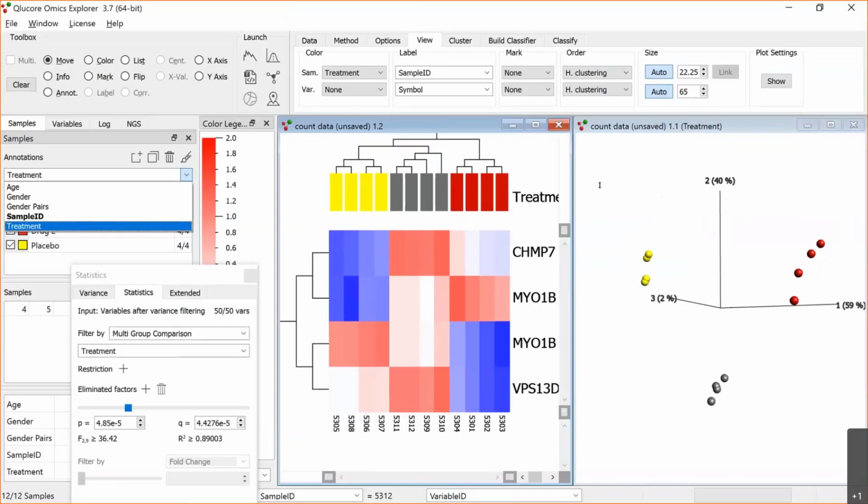And another question, how does such a separate file for feature length information look like? What information should it contain? So let me get back to you on that. My guess is, and I think that's correct, that it's a very simple text file with the first column including the unique variable IDs, and then the second column including the gene length.